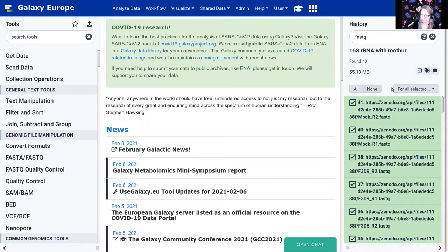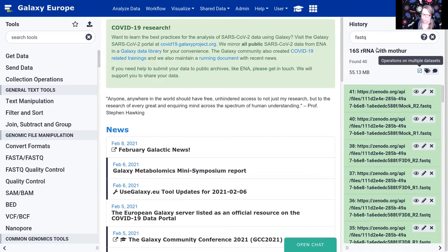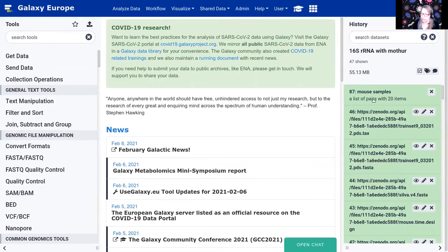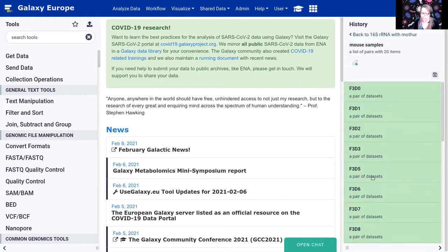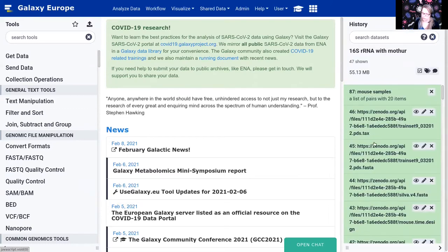Now we're back at our history. Click the checkmark box to exit selection mode, and clear the history filter to show everything. You should now see your collection with mouse samples — it looks like one dataset in Galaxy but if you click on it you see it contains 20 pairs, each containing a forward and reverse FASTQ file. This means we can run the entire collection through a tool with only one click.